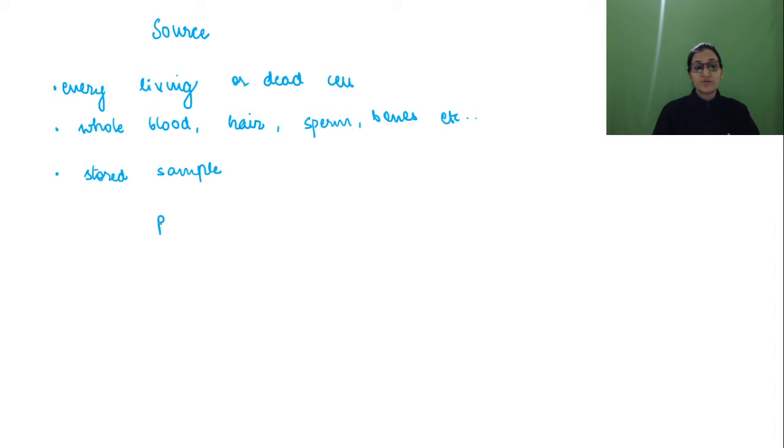Now after source, procedure. Isolation of DNA basically consists of four major steps.